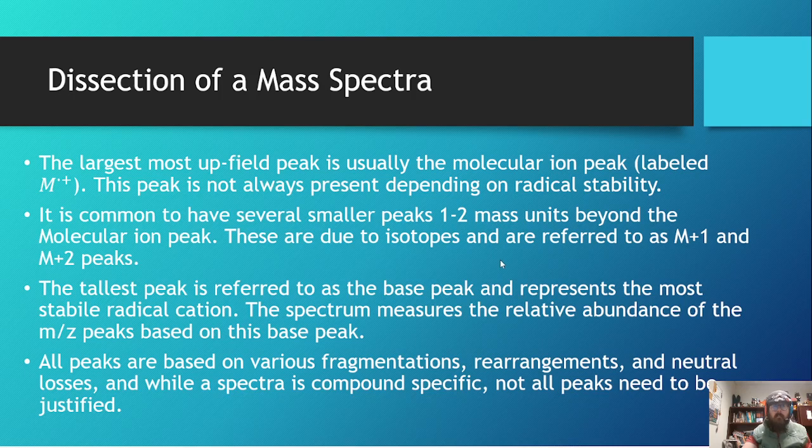When we're looking at things on the macroscopic level, isotopes don't really matter. But on the ionic level, if you get a guy with 1 isotope, he weighs a little bit more, and we'll be able to detect that. So +1, it's like, I have a carbon-13 in there, or carbon-14, or I have 2 carbon-13s.